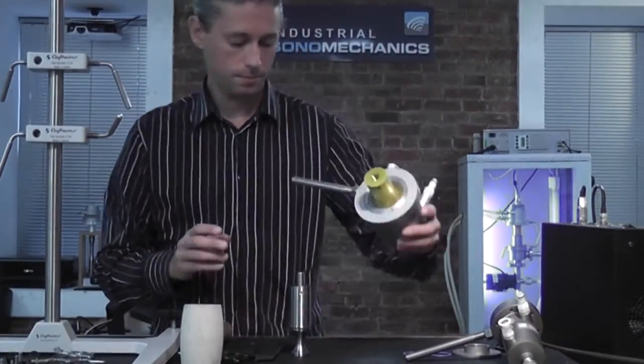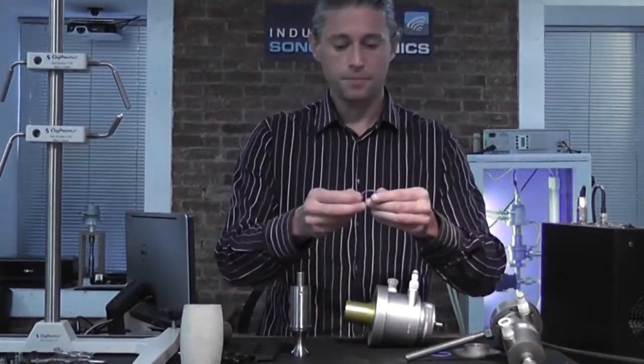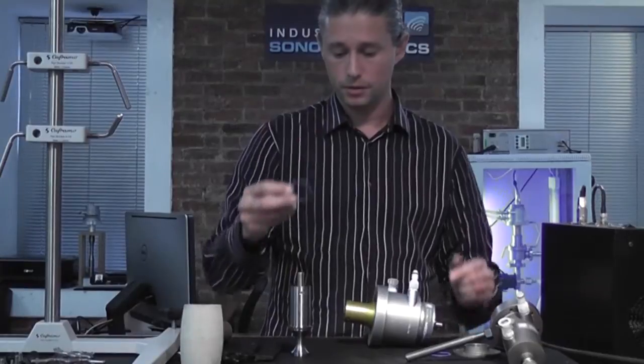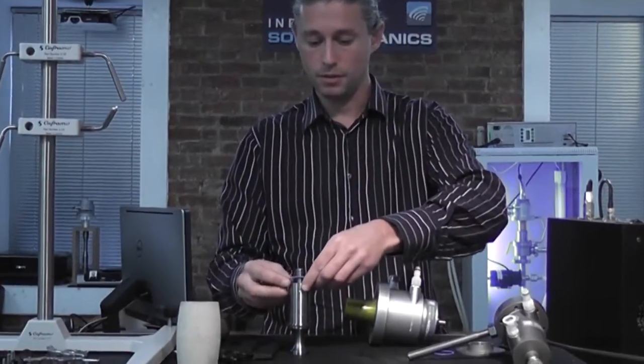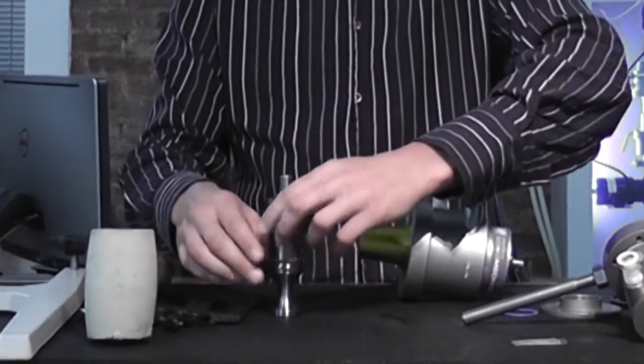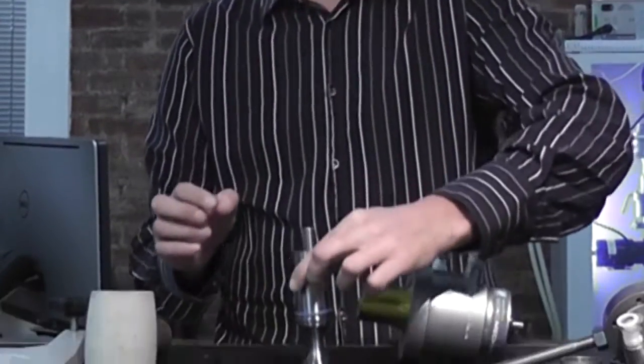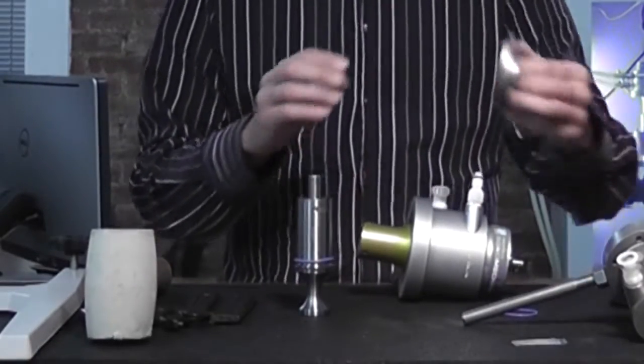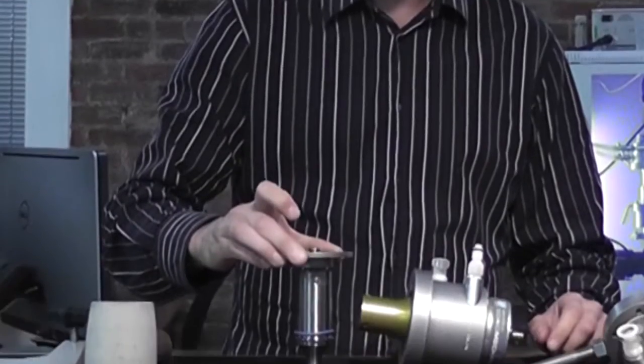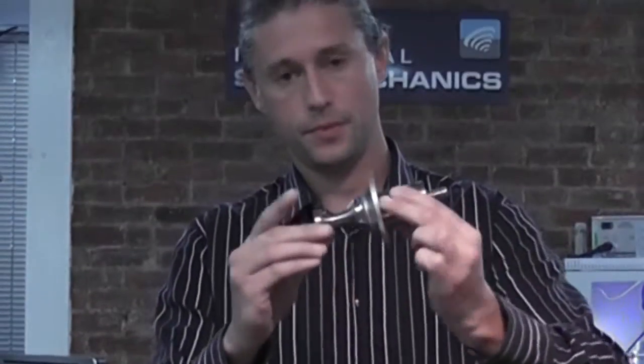Next step is to place the first O-ring from the back end of the horn above its flange, like so. Next, take the lid of the reactor chamber and place it over the O-ring, above the flange.